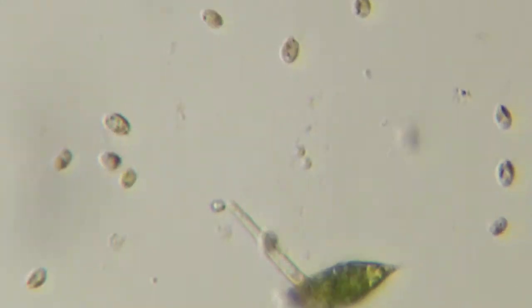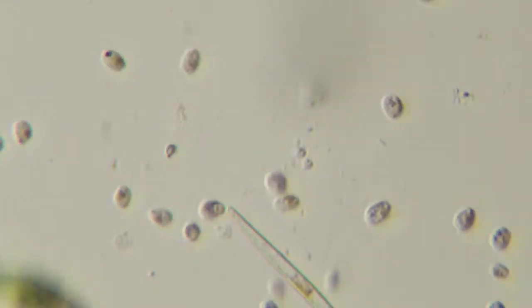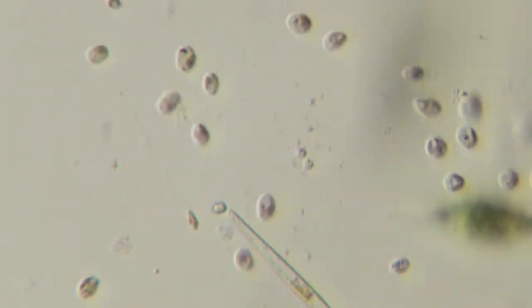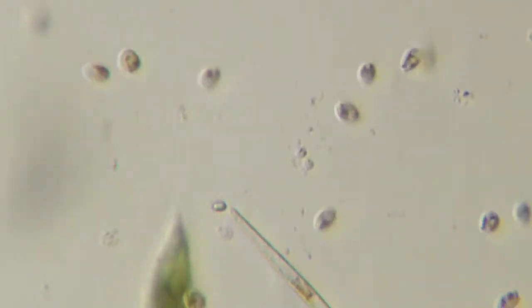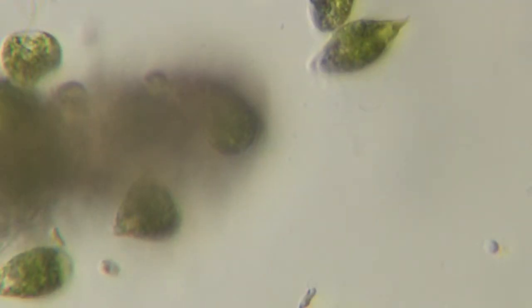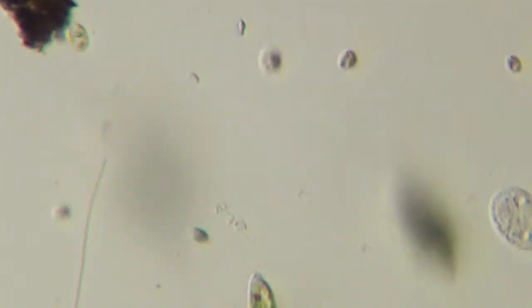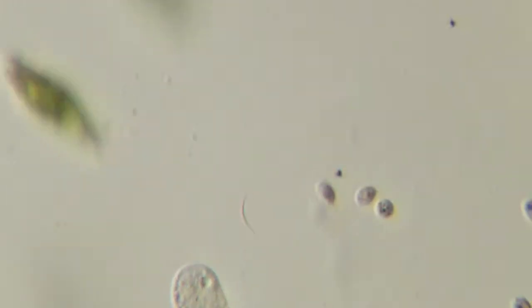There's some diatoms, some kind of boxy diatoms, a couple tapered diatoms there. These are just the shells at this point because most of the internal stuff is gone. You see the color is mostly gone out of it, so the silica shell is left behind. I think that's a Euplotes right there, cruising or bouncing around like a pinball.